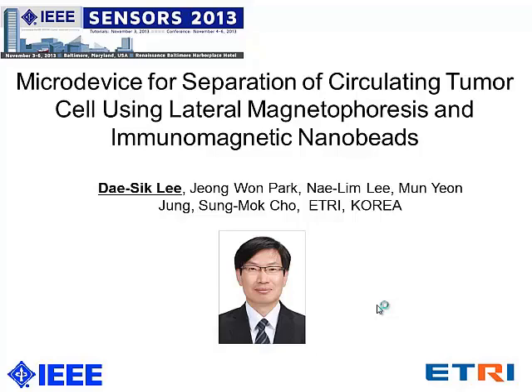My talk is about a microdevice for separation of circulating tumor cells using lateral magnetophoresis and immunomagnetic nanobeads. It's my pleasure to present here today.